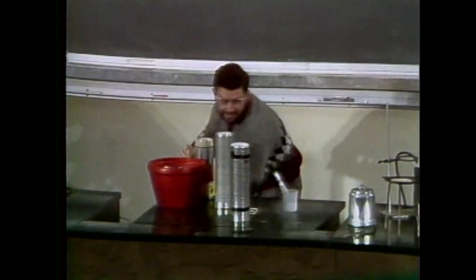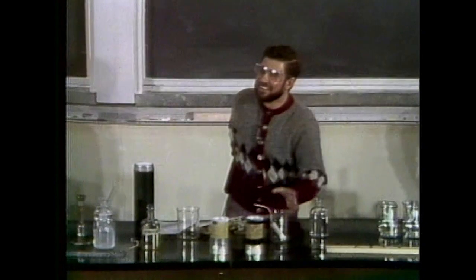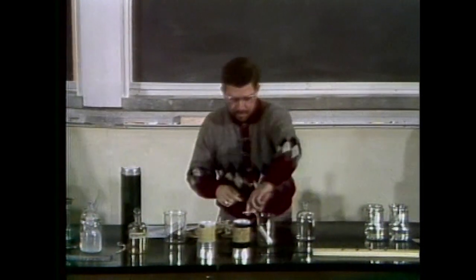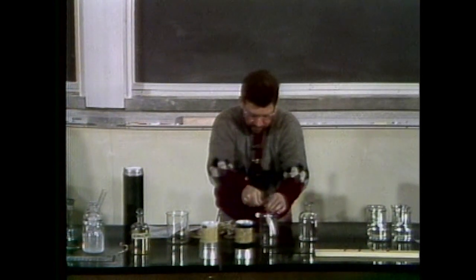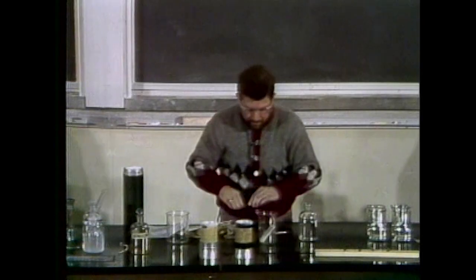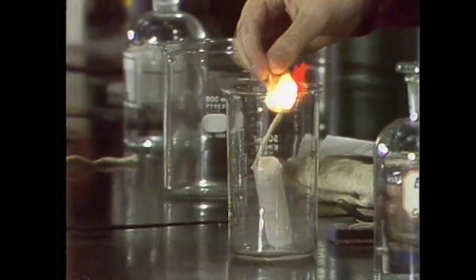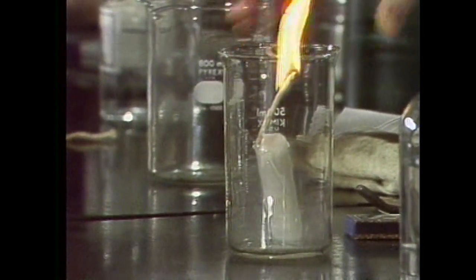Oh, I know what you're thinking. Yeah, that's it. All right, let's see what we can do here with this kerosene candle. Let's see what's going to happen to it.